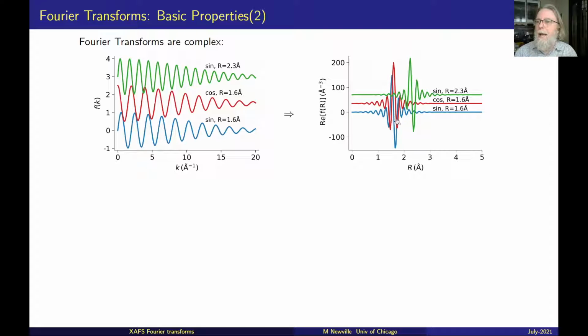In fact, they're nearly completely out of phase. That's the effect of being 90 degrees out of phase: where the red curve is high, the blue curve is 0, and where the blue curve is high, the red curve is 0.